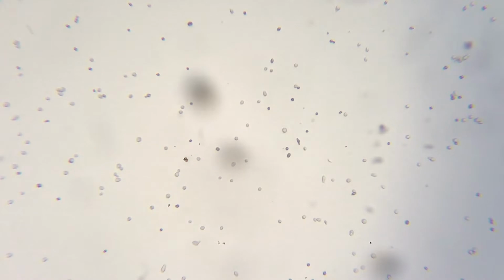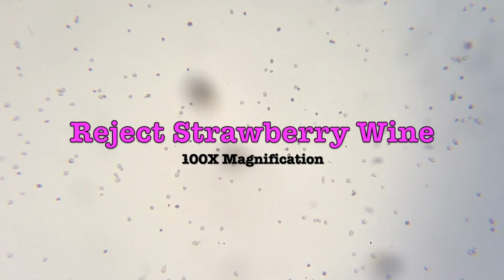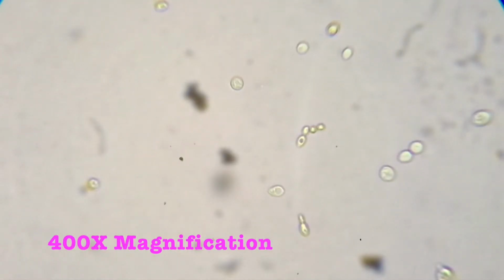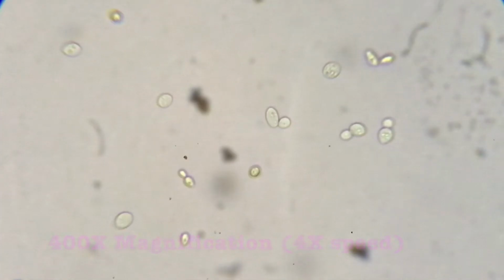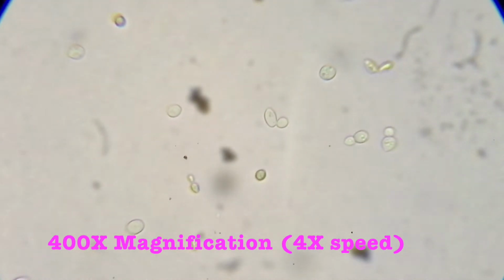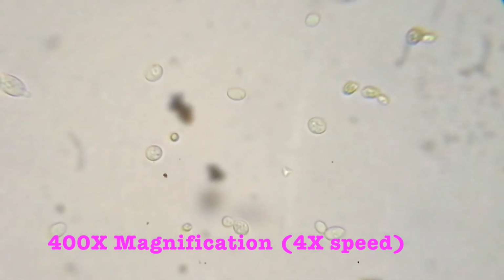Here we have the reject strawberry wine at 100 times magnification. So this is just one drop onto the slide. This is the reject strawberry wine at 400 times magnification. These all appear to be Saccharomyces cerevisiae.